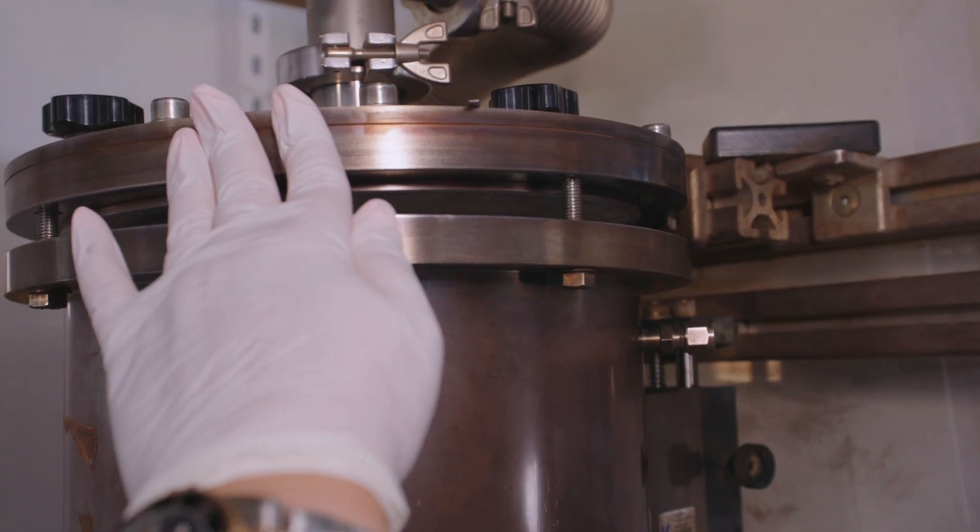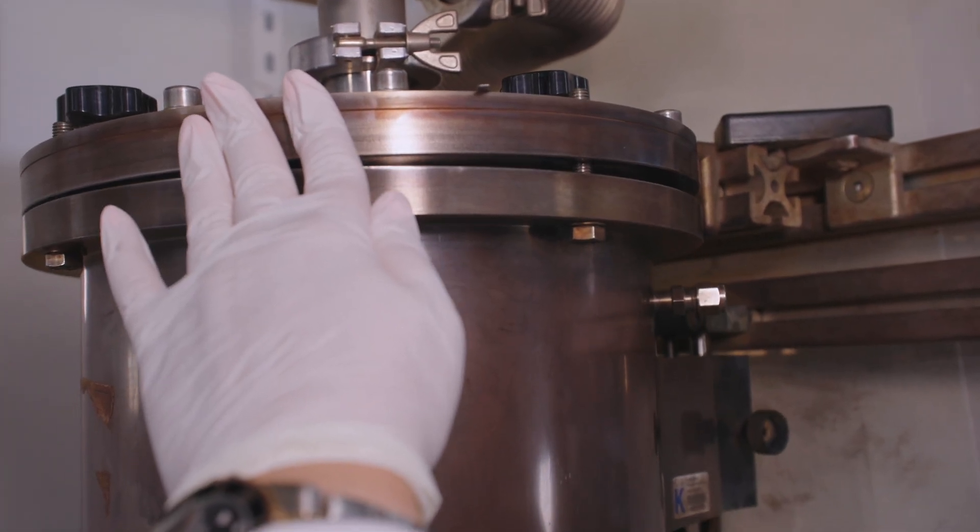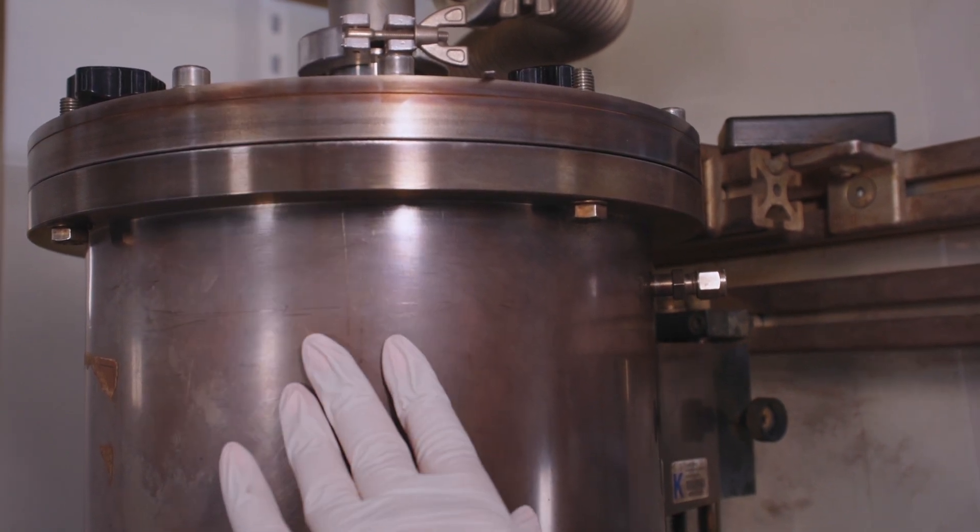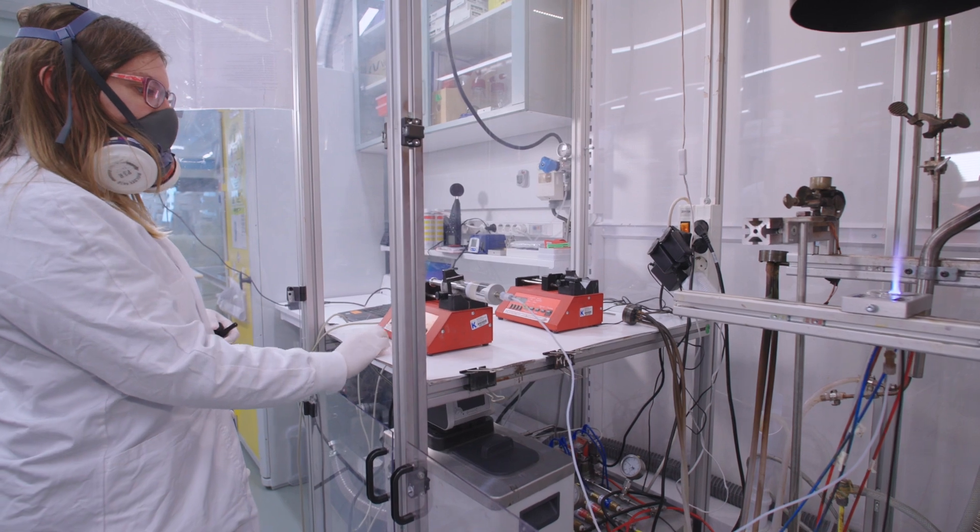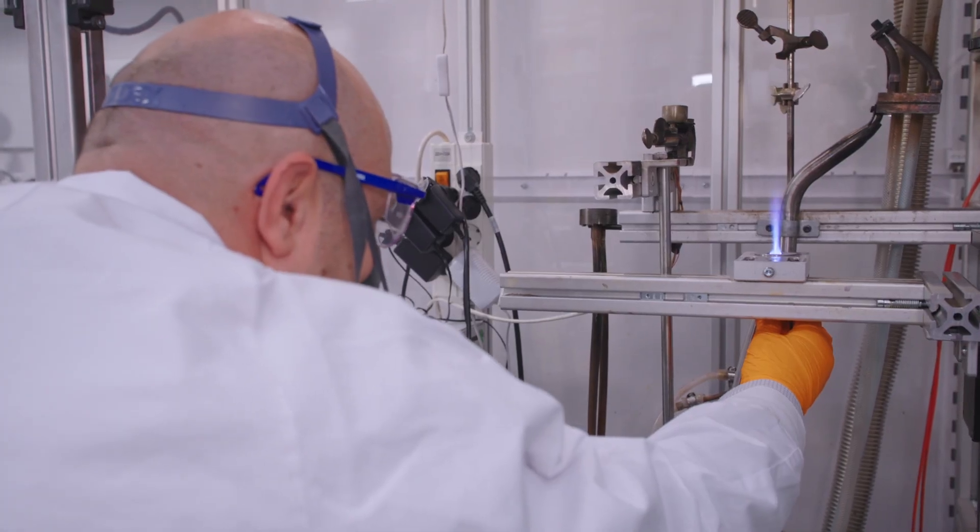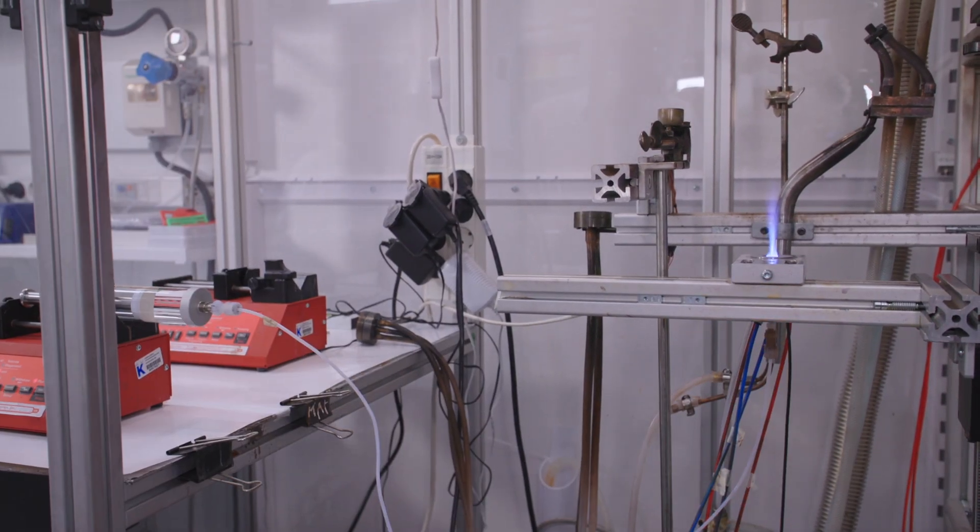It's also possible to place medical devices in the top of the reactor and coat them with an antibacterial layer. By adjusting the flame, the size and the composition of the particles can be precisely controlled.